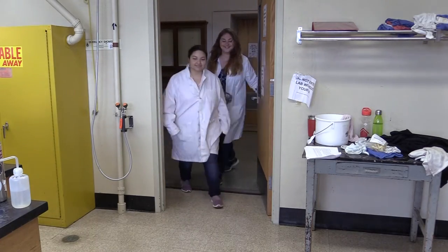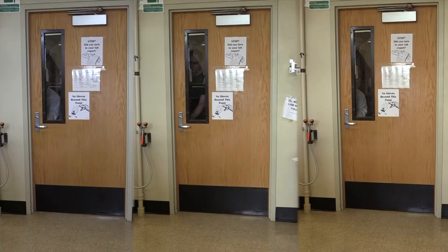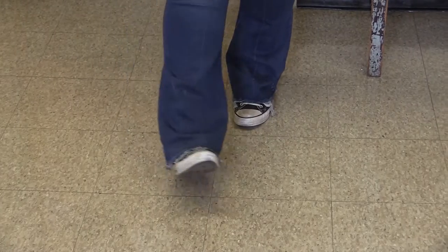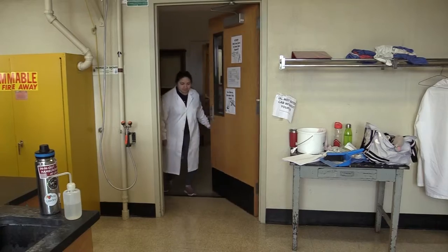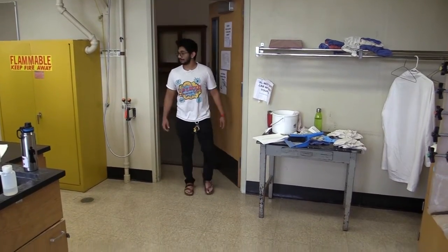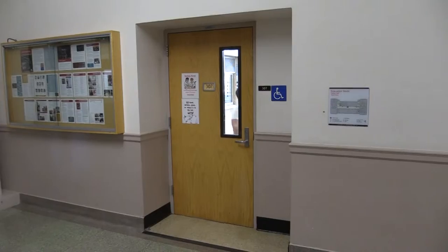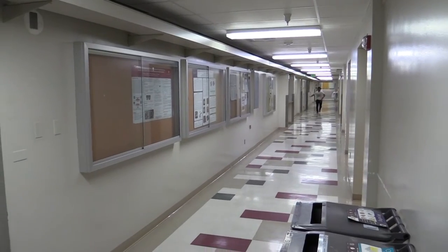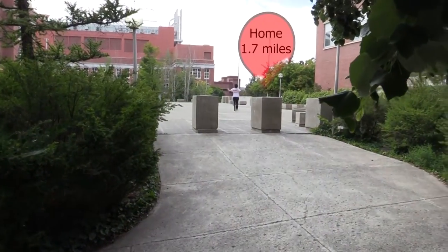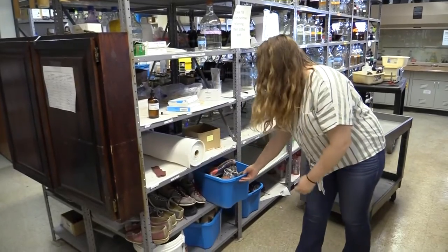Moving on to personal protective equipment. This begins with your lab coat, which everyone will need no matter which course they're in. The rest of your clothing has to cover every part of your body except for your hands and your head. This means you can't wear capris, shorts, or anything that may leave any part of your legs or ankles exposed. You also have to be wearing shoes that cover your entire foot, not just your toes. If your shoes leave the top of your foot or your heel exposed, they're not okay for lab. If you're not able to run home to get shoes, our stockroom has bowling shoes that you can borrow in all different sizes.